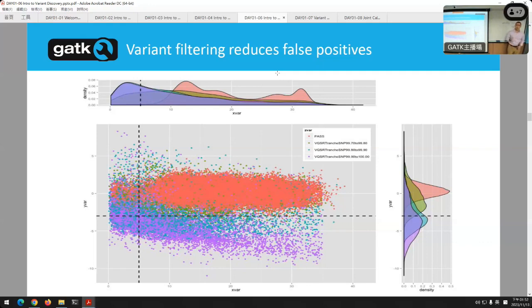So there's always filtering of the variants that we do downstream. After we do this joint calling and see all the data together, we can say, look, this thing looks low quality in this sample, but high quality in that sample. So maybe it's fine. It just wasn't sequenced well in this one. But this variant is low quality in all 100 of these samples. That's probably an error. It's probably a mistake in the sequencing, not a real mutation. Okay, and so we'll show you examples. Tomorrow we'll talk all about filtering, and there's a lot of machine learning that we do now for this. It's a very, very good project for machine learning.